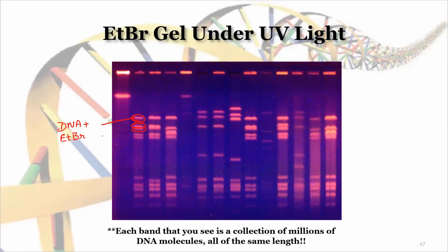Okay, so this comes in the exam. How is staining done? This is a kind of staining method, like you have learned earlier in making slides and all. What is the importance of staining? Staining is basically a process of providing some dye, and when you stain, the cells become visible under the microscope.